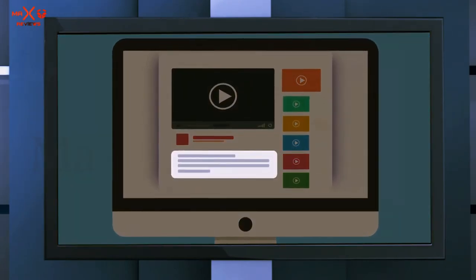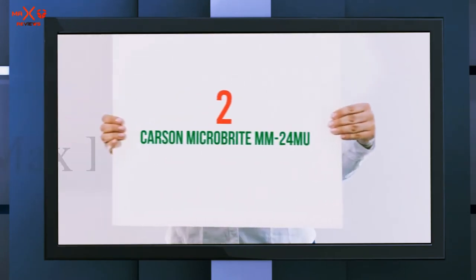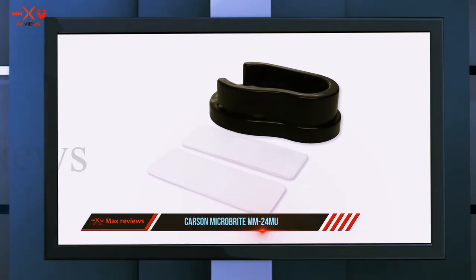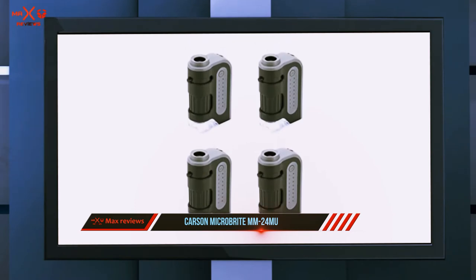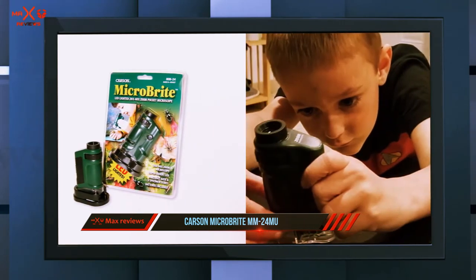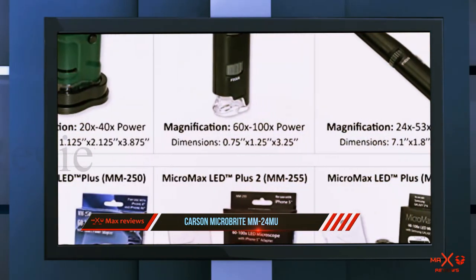Coming in at number two, the Carson MicroBrite MM-24MU. This pocket model gets praise for being a high quality introductory model from reviewers. 'It would be a great gift to a child who may be interested in science,' writes one, 'and being so inexpensive it is a low risk investment. This scope is much easier to use and has better image quality than other simple microscopes that I have seen.'